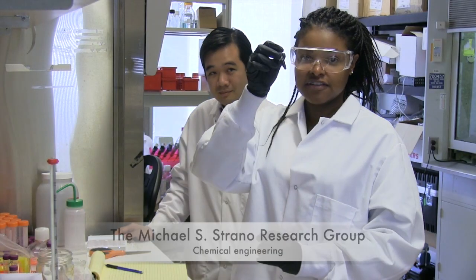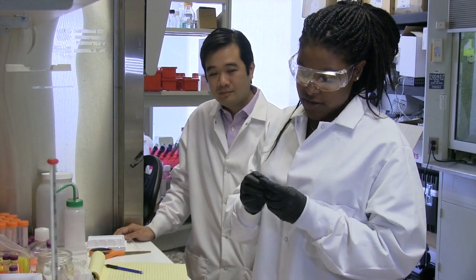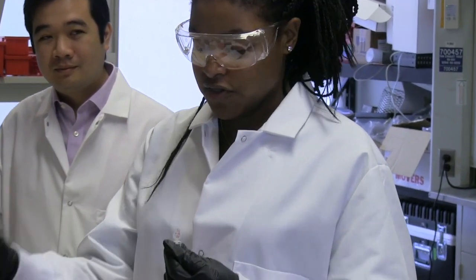I have my GC15 right here. This is the original concentration, and then I'm diluting it so we can use it for the fluorescence machine. And I'm going to do the same thing for AT15, make another dilution.